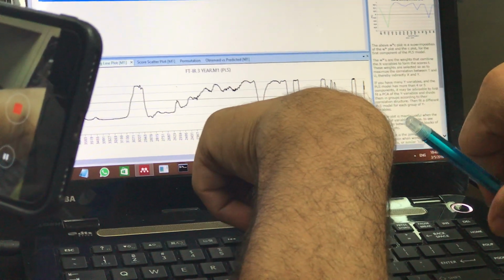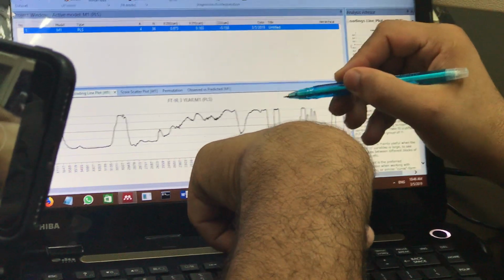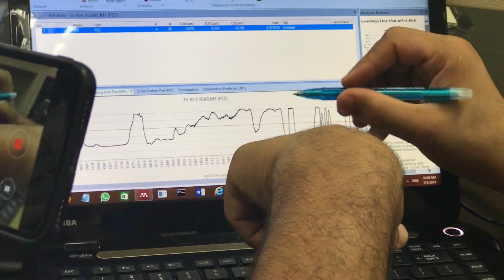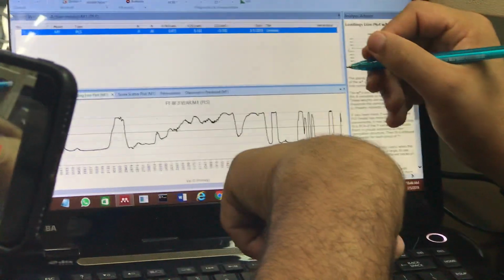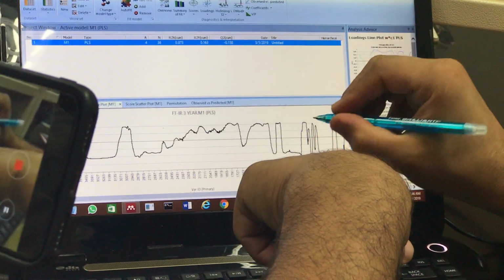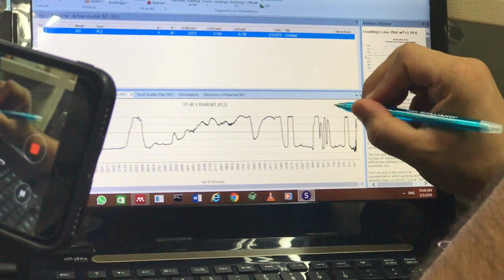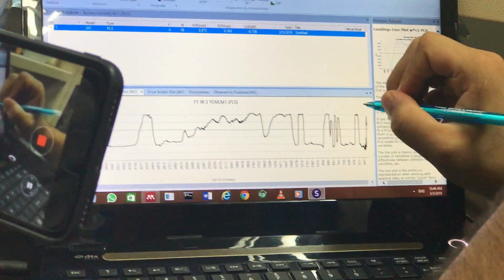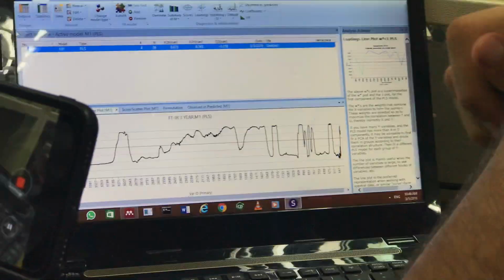This one, 1700, is C double bond O. And here it can be S double bond O. And here you can see CO. And this one is CX. That means the X can be a halogen.